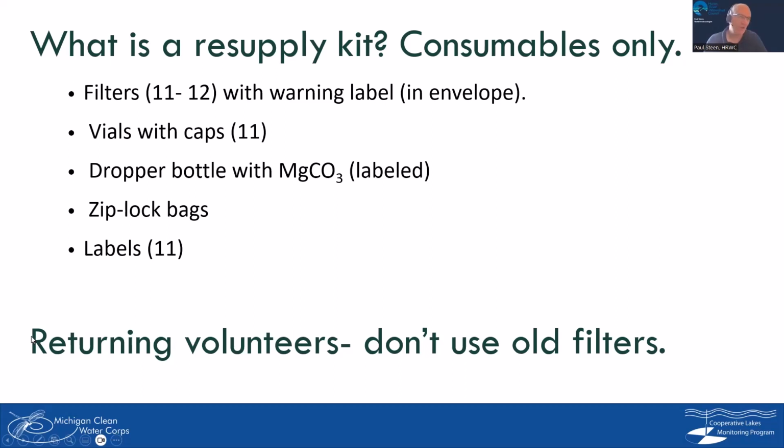A few years back, we ran into an issue where we had some bad filters, and we don't want those circulating around and being reused. Okay, so always get rid of your old filters. Just use the new ones for that year, so we know that everyone's on that equal playing field for the year.